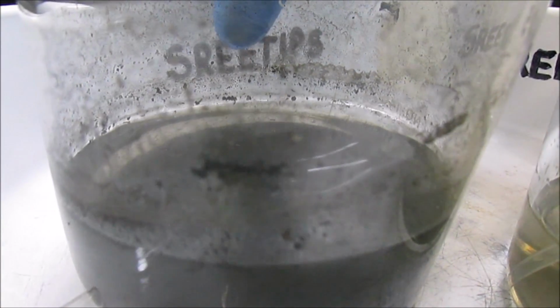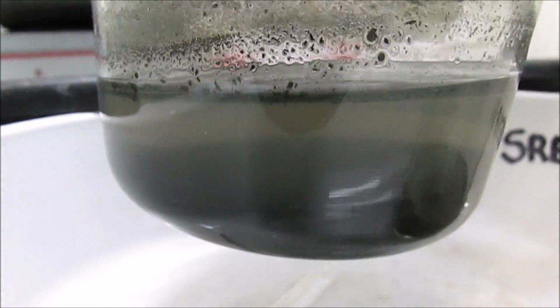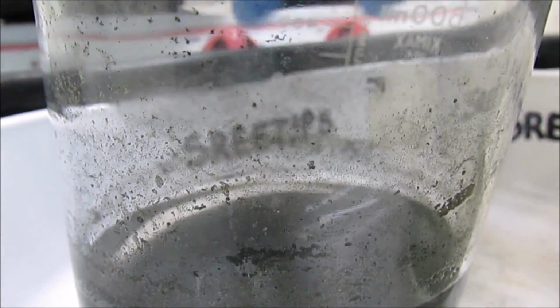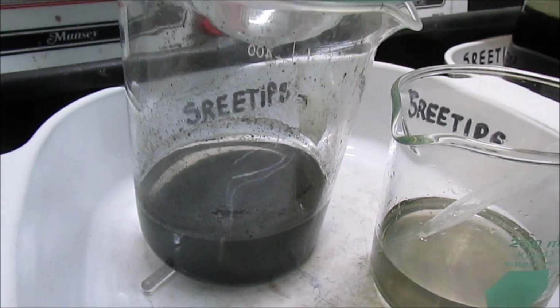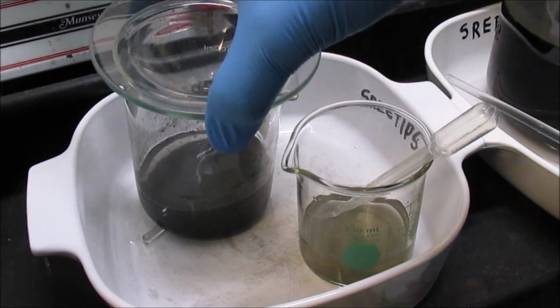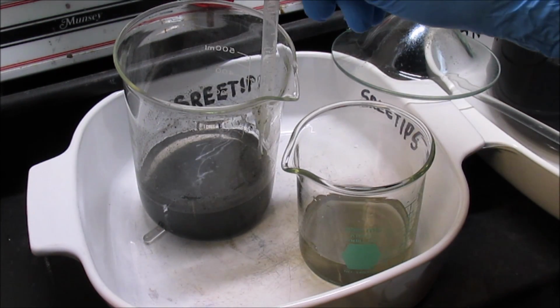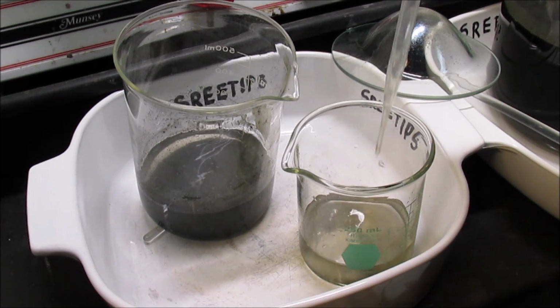This is our black powders. I think all the zinc's been dissolved out of there now. What I'll do is draw that liquid off so that the black powder doesn't go back in the solution. These metals like to go back in the solution if they sit in an acidic bath.